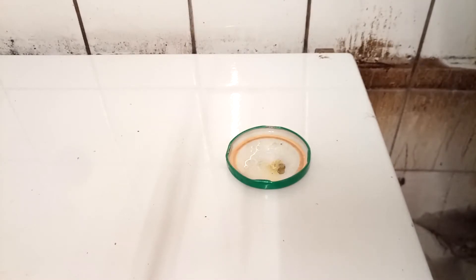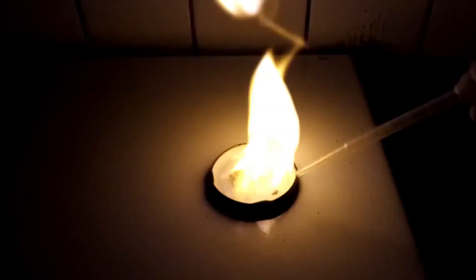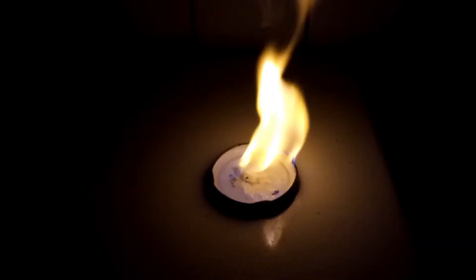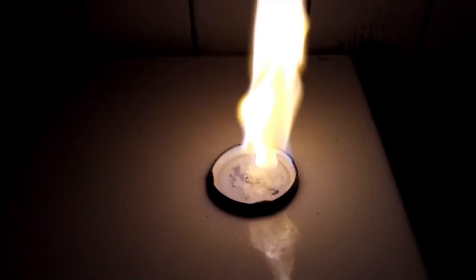Now I want to show something else about this reaction that is really interesting. I've used way too much ethanol here because I don't actually want to ignite. Instead I'm going to turn the lights off and then add acid — and you will see what happens. Isn't this just cool? It's some weird chlorate-based chemiluminescence phenomenon. I don't know why — maybe I'm bad at researching, but I couldn't find anything about this online.